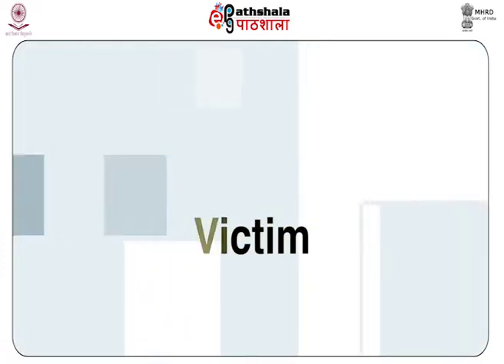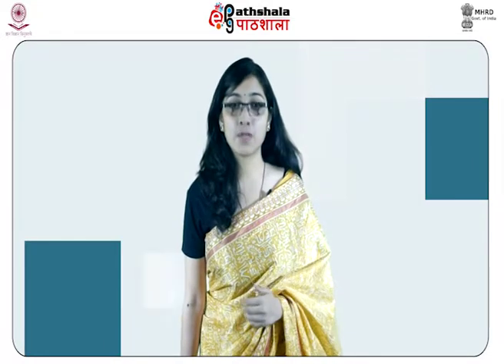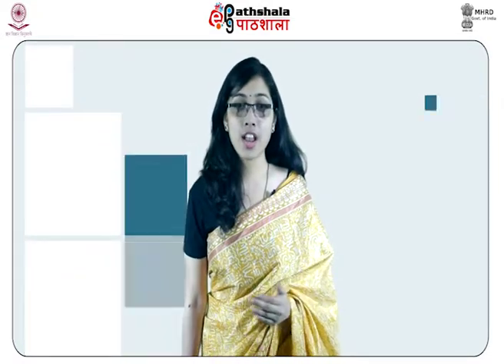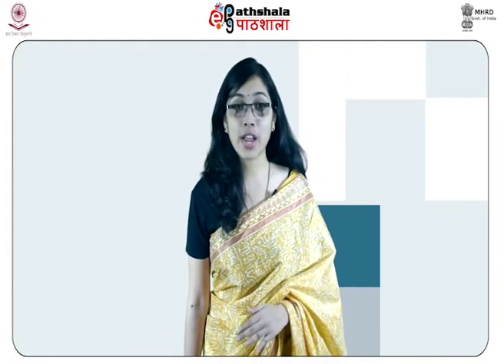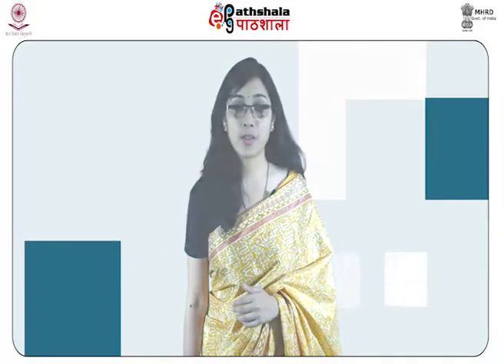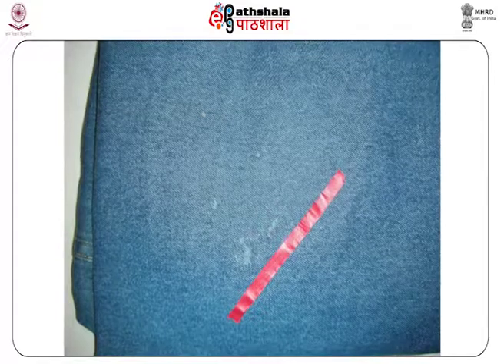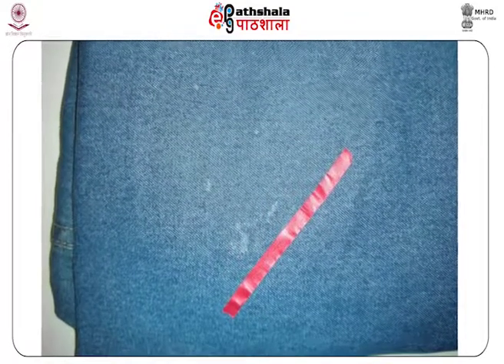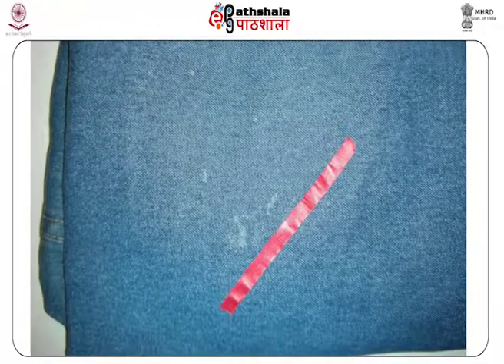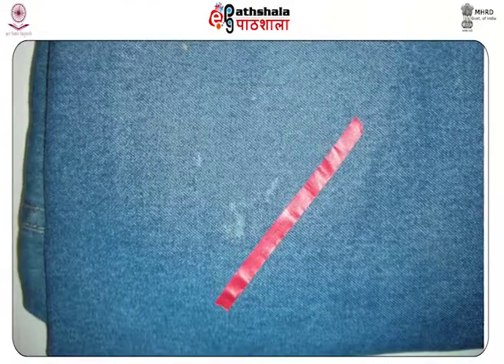Collection from victim. The victim carries semen stains on the affected parts, on the skin, hair close to these parts, and on the clothes, especially on the undergarments. All the clothes should be taken into possession. The help of a doctor should be obtained to collect the swabs from the affected and close-by parts of the body and the hair suspected to carry semen stains.